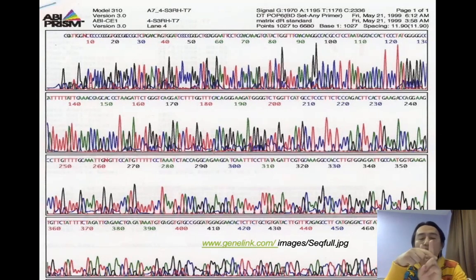So why does it have two outputs? The first one, the important one, is this graph, because from this graph you can know if there is any problem in sequencing. Okay, so is the position of the nucleotide correct or not, based on this graph itself. So for example, okay, if you look at the graph, it is spiking like this, right?